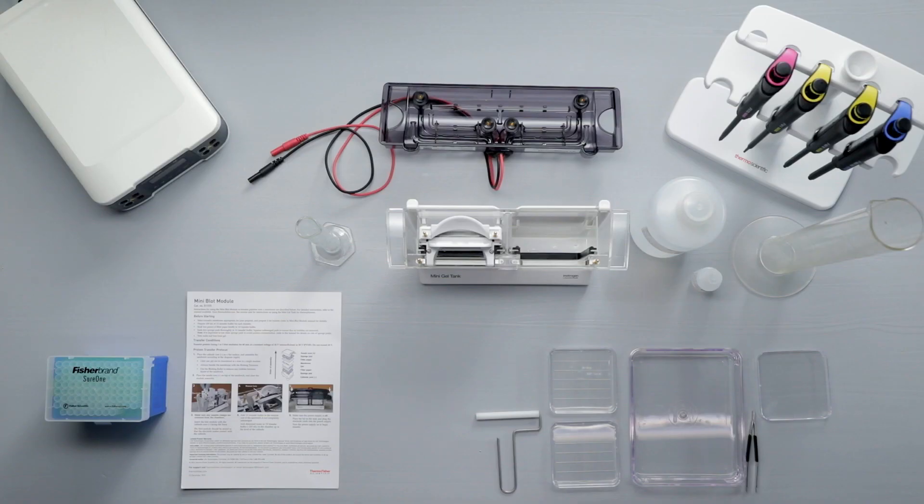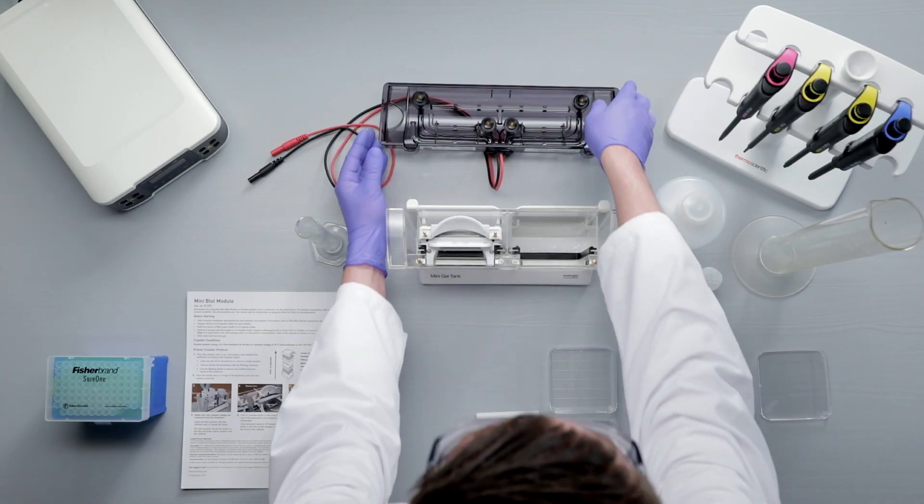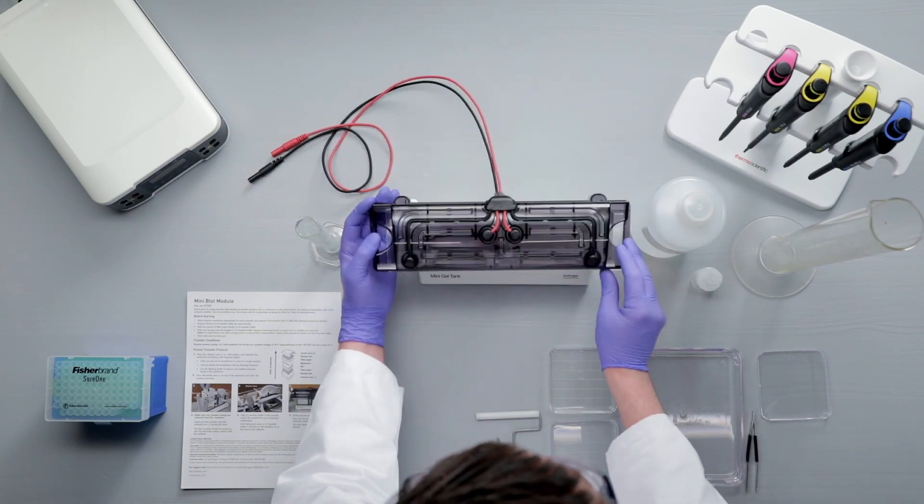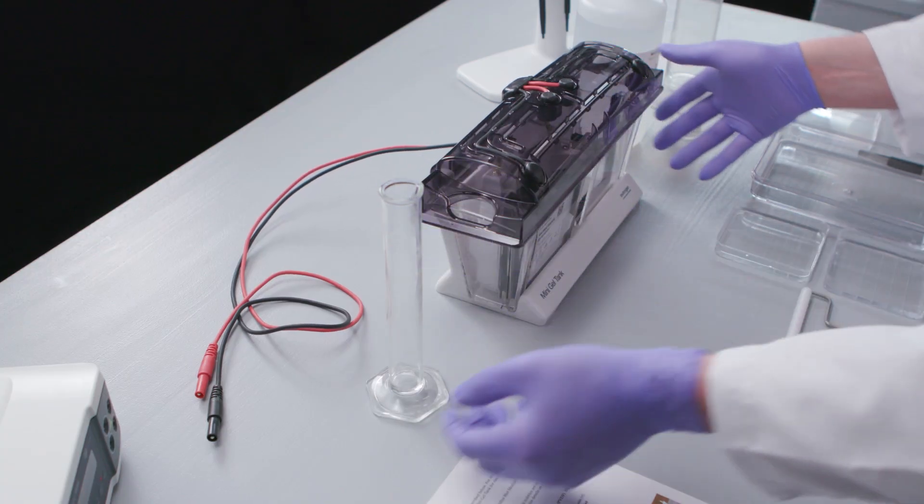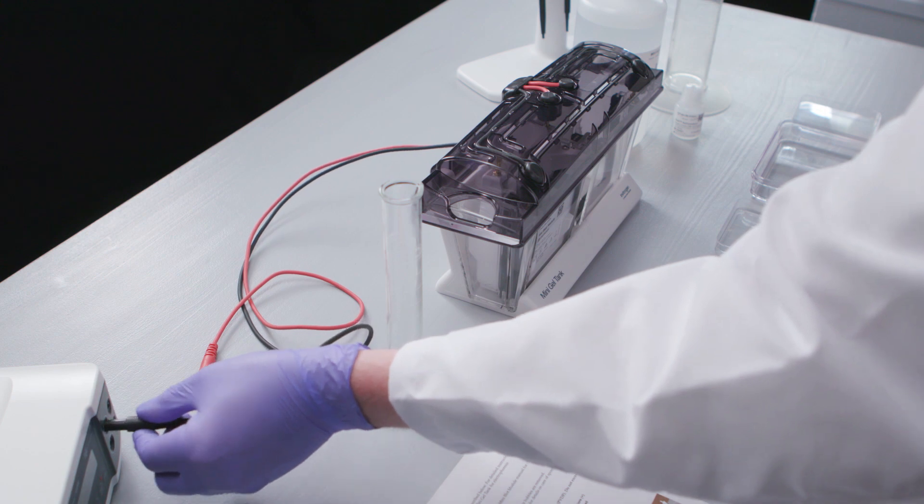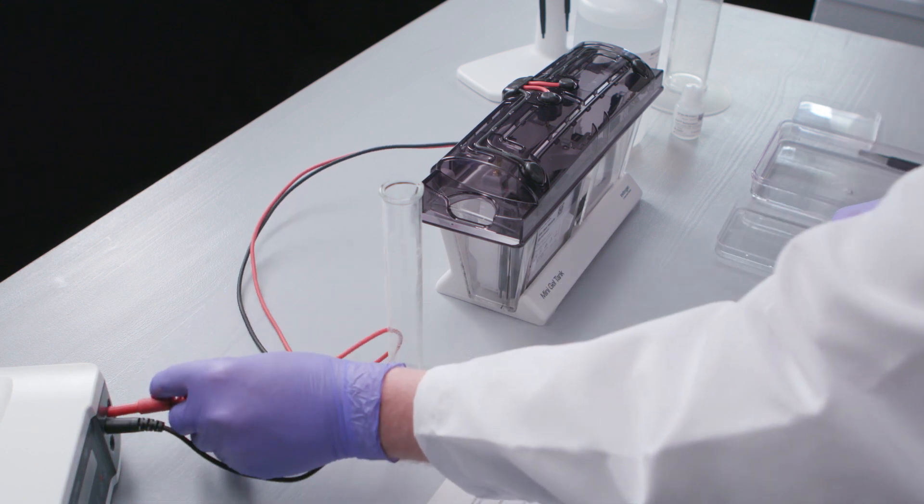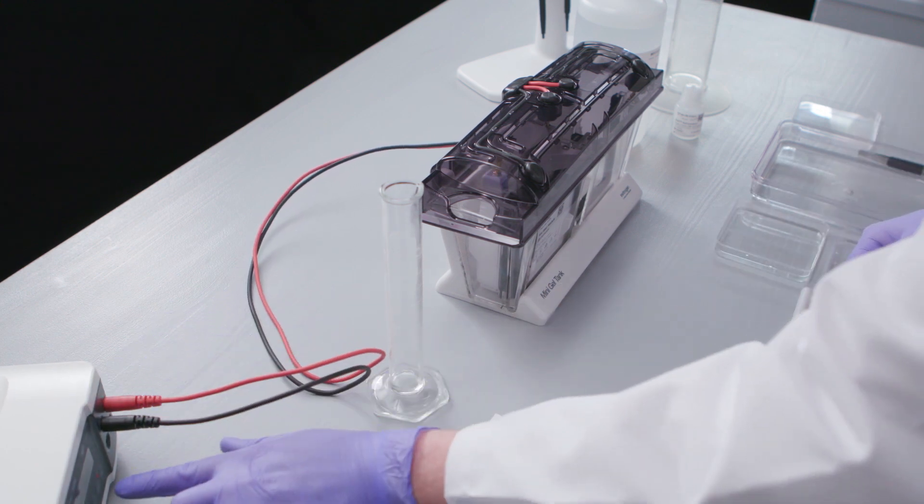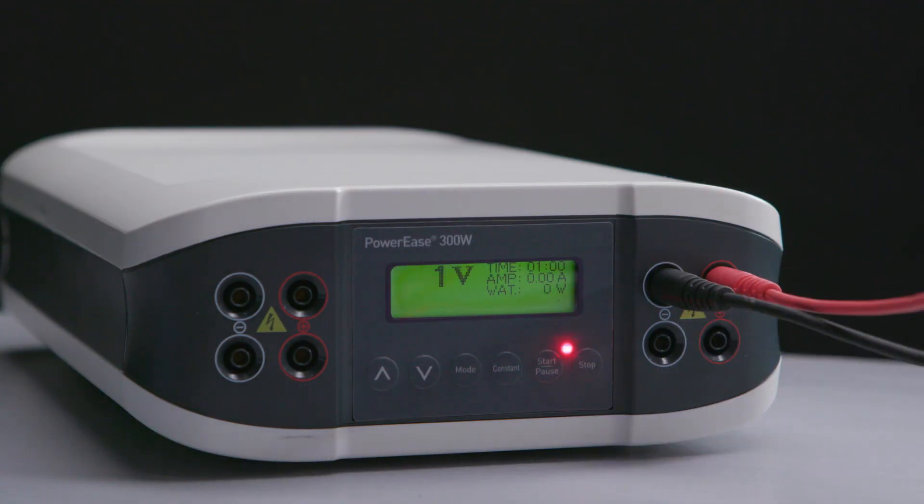Make sure the power supply is off. Place the cover on the tank and plug the power leads into the power supply. Turn the power supply on to begin the transfer. For nitrocellulose membranes, transfer at a constant 10 volts for 60 minutes. For PVDF membranes, transfer at 20 volts for 60 minutes.